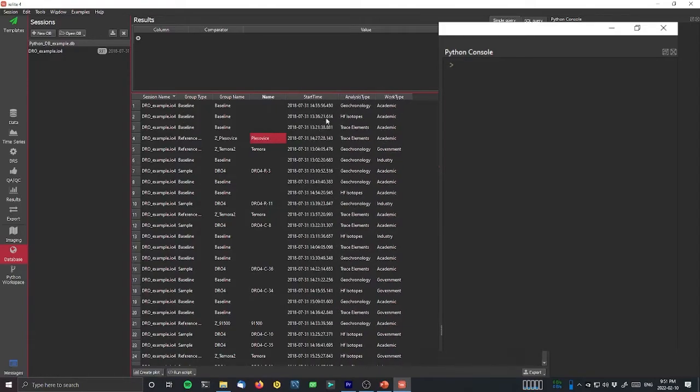Now I could do this off any of the columns, it could be numeric or text data, but in this case I'm just going to do it based off one of the text columns, so it's nice and easy to see, because with numeric data it could come from anything. So first off, I'm going to create an array that has the same length as the number of selections that meet my criteria. So I'm going to create an array that is the values from the group name.